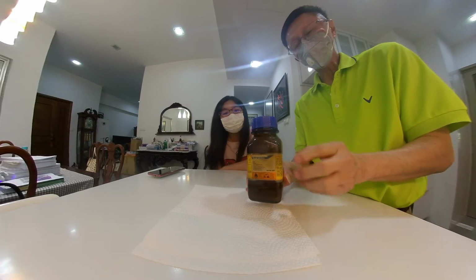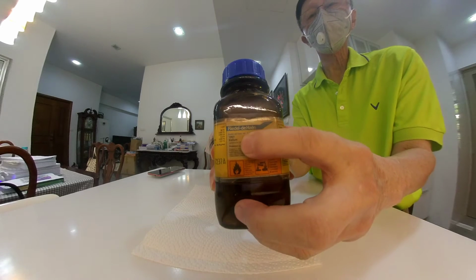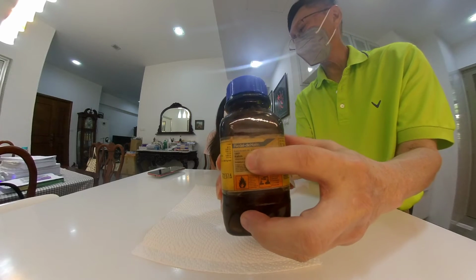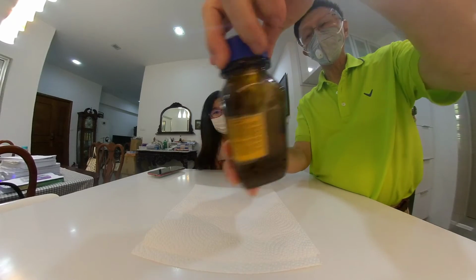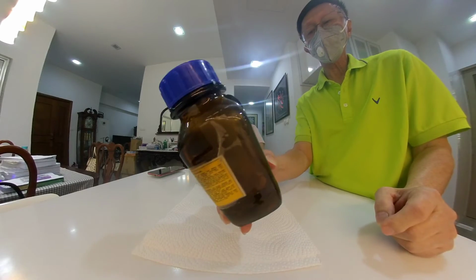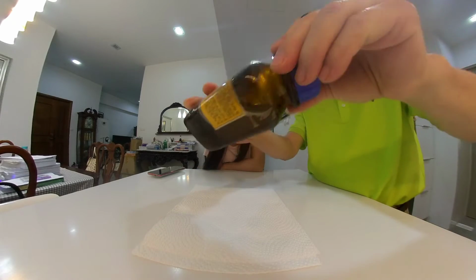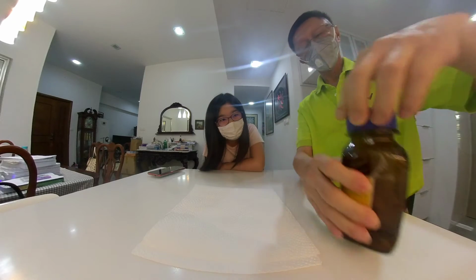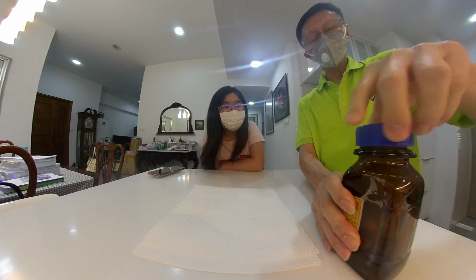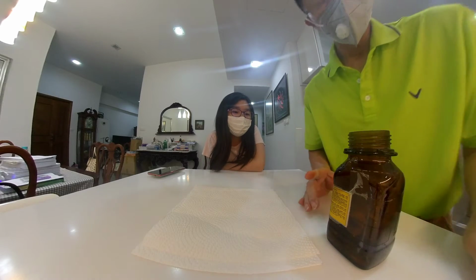Alright, potassium is known as kalium, K-A-L-I-U-M, okay? And like sodium, potassium is kept in oil. Right? Can you see the oil inside there? Yeah. This is to prevent it from coming into contact with oxygen and water in the air.